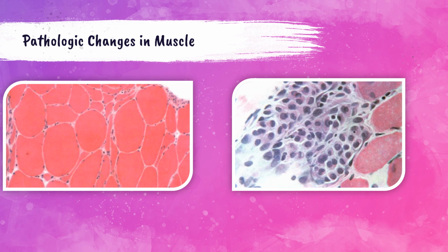So the photo on the left-hand side of the slide shows a frozen muscle section that's of course stained with the H&E stain. It shows a marked variation in muscle fiber size. There are also numerous fibers that have atrophy that are in small groups. So you see how there's variations between all of these, and for example, these are all much smaller than these, right? Okay, so those are the fibers that are experiencing atrophy. So this section suggests the presence of a neuropathic disease or neuropathy.